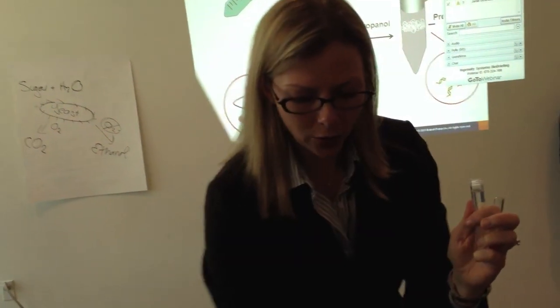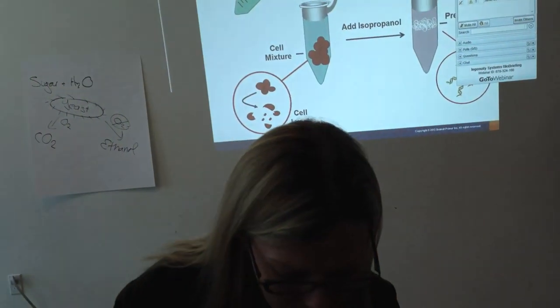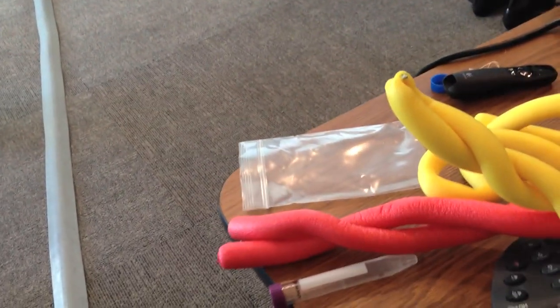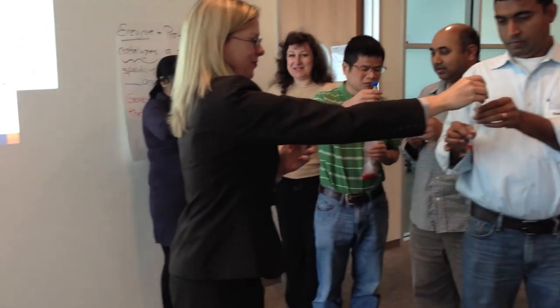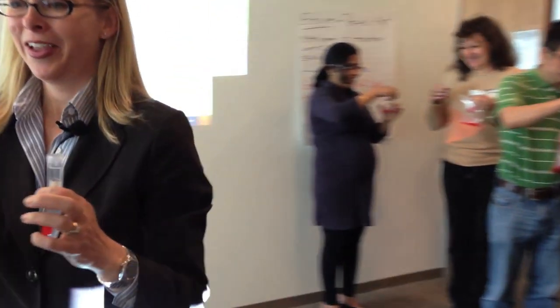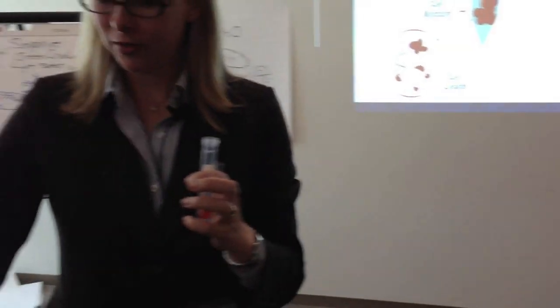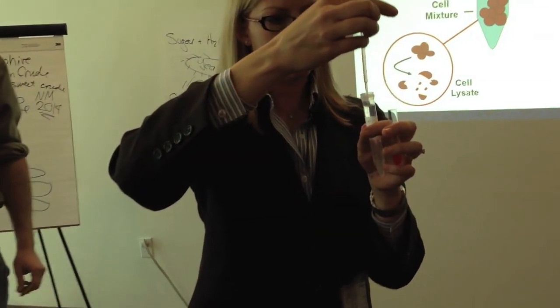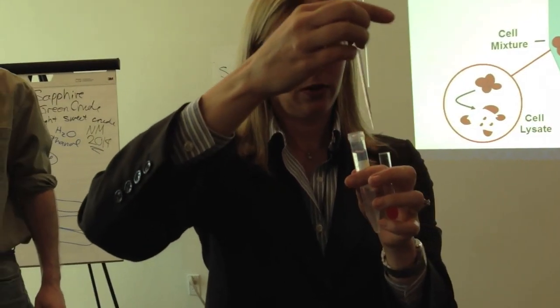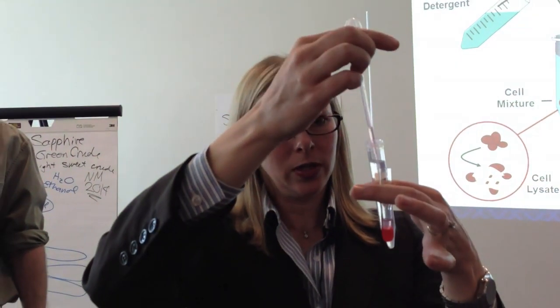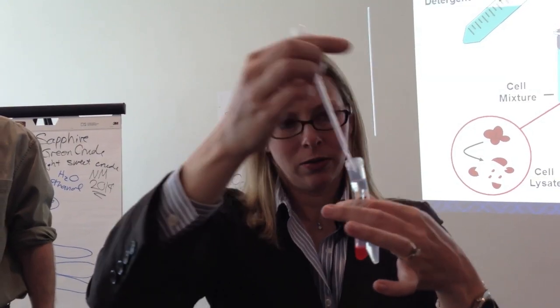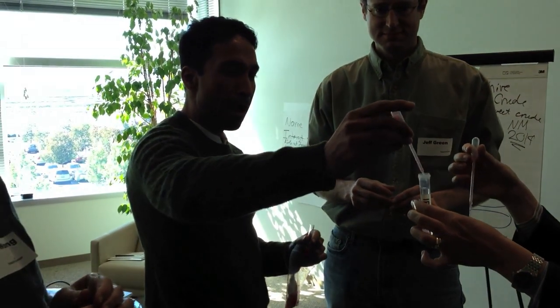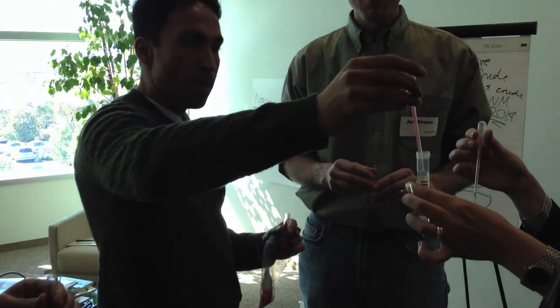We're going to add the same volume, and I've got four of these, so it's going to be take some and then pass it on. We'll use the same pipette, so again add the same amount, roughly one milliliter. One milliliter, and go ahead and squeeze it in. Doesn't that contaminate it? It does. That's true, it does contaminate the pipette. That's okay.